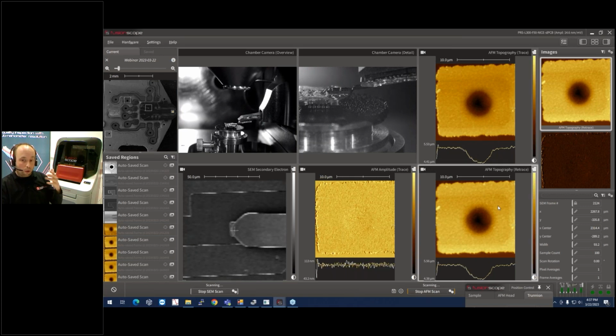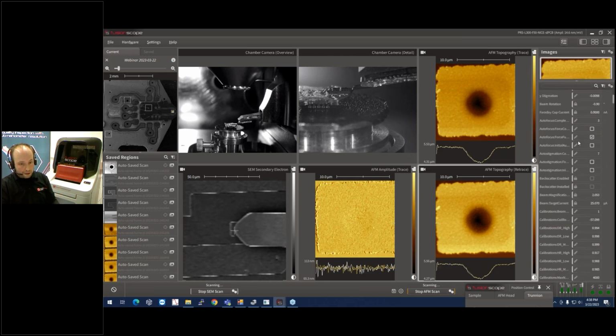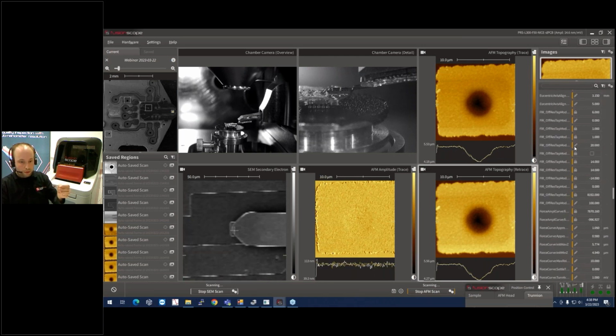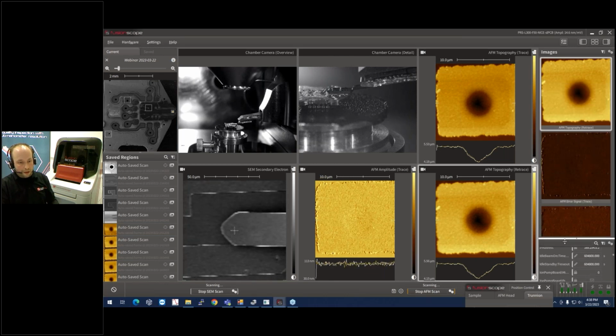You can have it all in one software and customize it for your needs. You have all the parameters of the FusionScope accessible in a huge list. You can look them up and change them. But if you do not need this, you can just move this list away and focus on the measurement data.